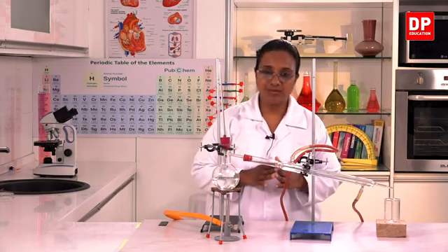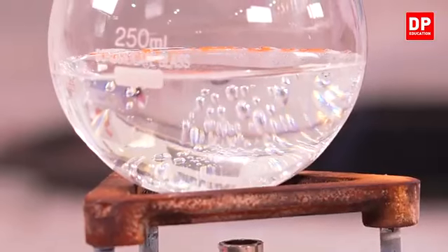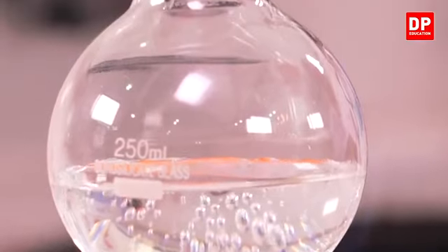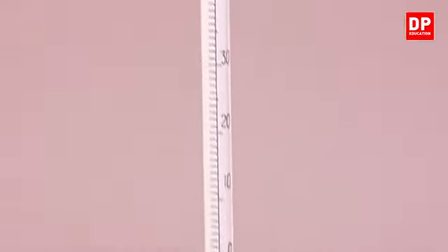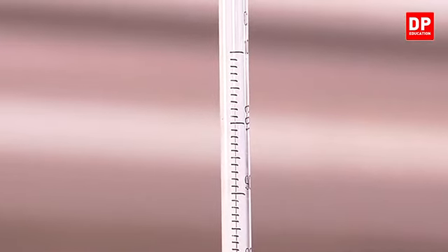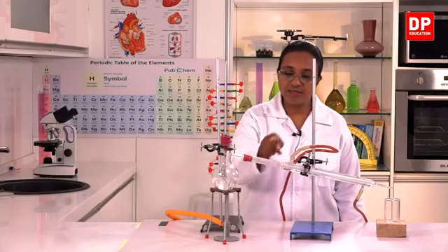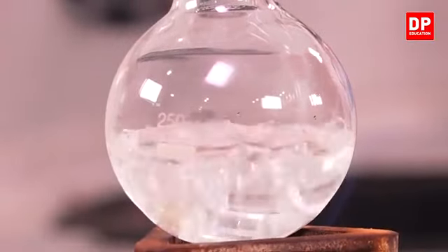Now that the setup is ready, I will start the distillation process. So students, you can observe that the water has started boiling, and also if you observe the temperature of the thermometer, you can see it increases and it comes to a certain point and remains at that point. At that point, the water is boiling and the steam with that particular temperature will escape through this outlet and go through the condenser.